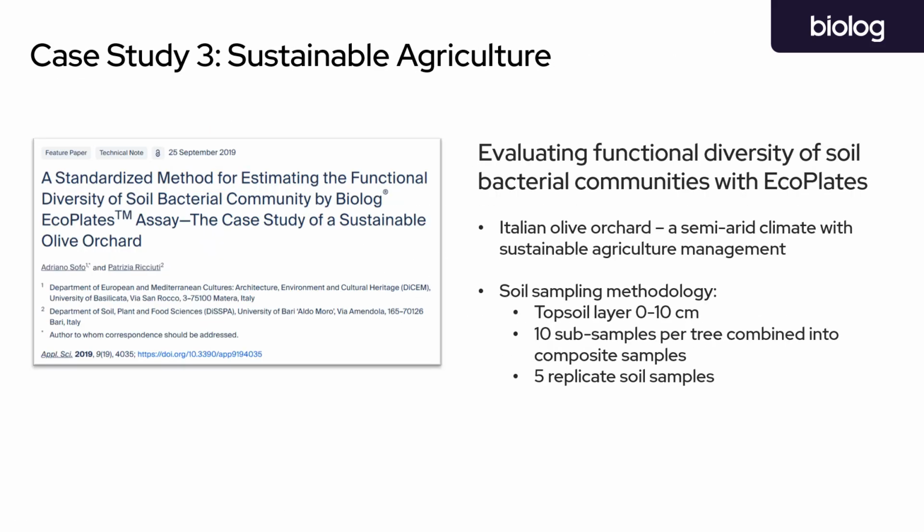And ecoplates are also widely used in agricultural research. For example, researchers studying Mediterranean olive farms used ecoplates to measure functional diversity of soil bacterial communities. And careful sample preparation was essential in this paper, including soil dispersion and normalization of the bacterial density before inoculation. And this technical note does a great job at documenting their whole workflow in great detail.